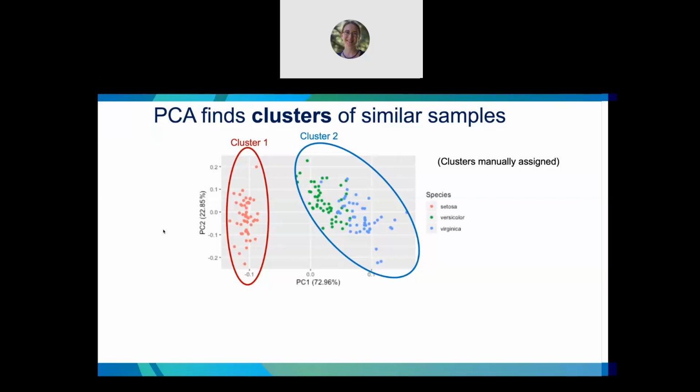So, when you see a plot like this, the first question that comes to my mind as a bioinformatician is why? Why are these samples separating the way they are? When you're looking at a PCA plot, we've merged in hundreds or thousands of different variables.